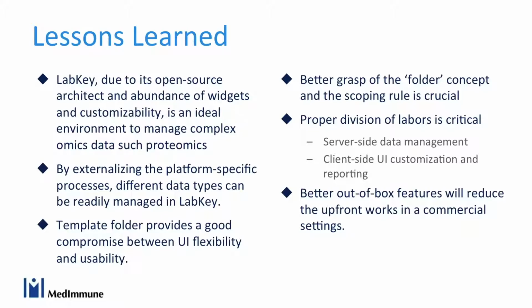So in our case, what LabKey serves is a data management tool: we have data coming in, we do a next step, and a next step, and we capture the results. But each of the analysis steps is all done in the script that we have control over. And then, like I mentioned, the UI customization really works better if we ask people to always create folders from the templates.